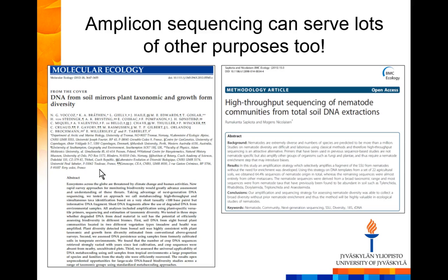And you can, of course, analyze microbial communities with lots of other genes than just 16S. We have a collaborator at the University of Oulu who is interested in the diversity of antimony and arsenic metabolizing microbes in these peatland soils that treat gold mine waste waters.